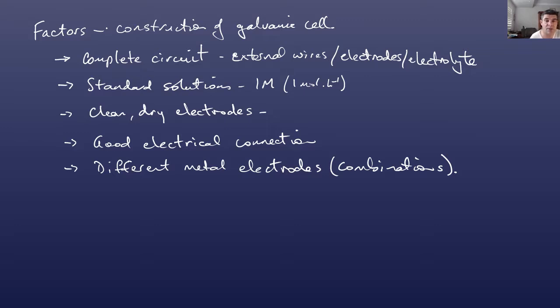replaced the electrolyte. We looked at water, we looked at sodium chloride solution and also at sulfuric acid solution, and then we replaced the electrodes as well. So we looked at a combination of zinc and copper, copper with copper, and also carbon with copper. So I'll give you an opportunity to have a look at some of that. Again, apologies for the audio.